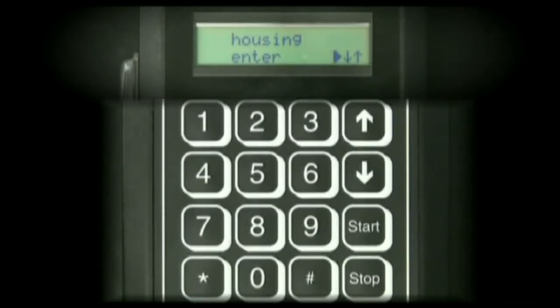This is the entry screen to identify the filter housing used. Letters comprise most of the housing descriptors, so it is recommended this entry is skipped when programming via the device. Press the up arrow on the device keypad twice.